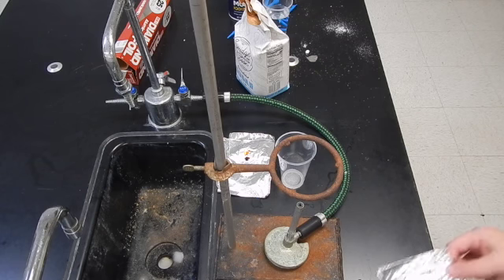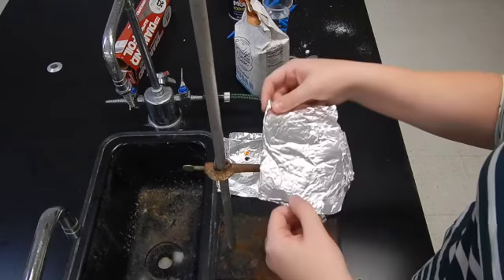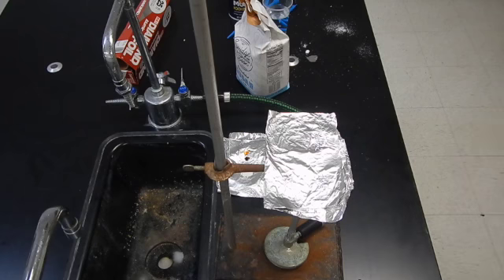So here I have the aluminum foil. You notice that I did label salt and sugar so we can keep an eye on which one melts first, which one has a relatively high or relatively low melting point.